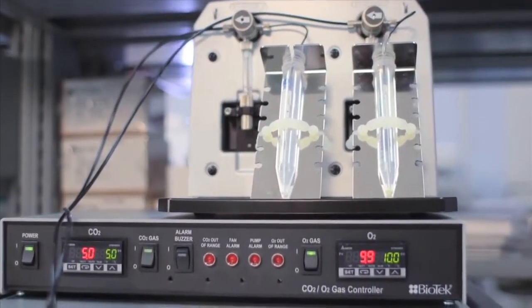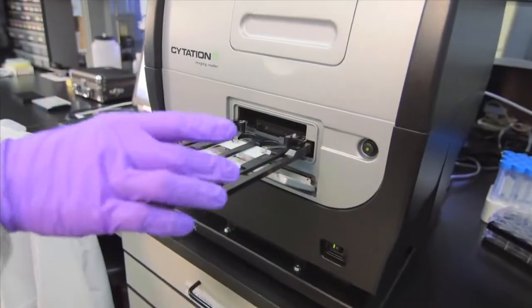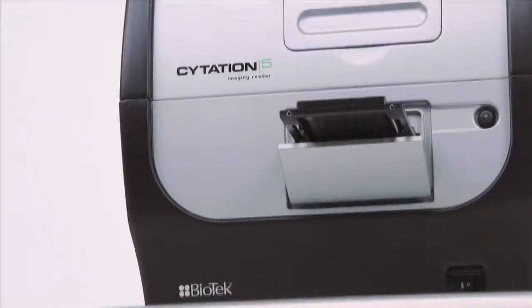With a special emphasis on live cell assays, Citation features incubation to 65 degrees C, CO2-O2 gas control, shaking, and full support for time-lapse studies.